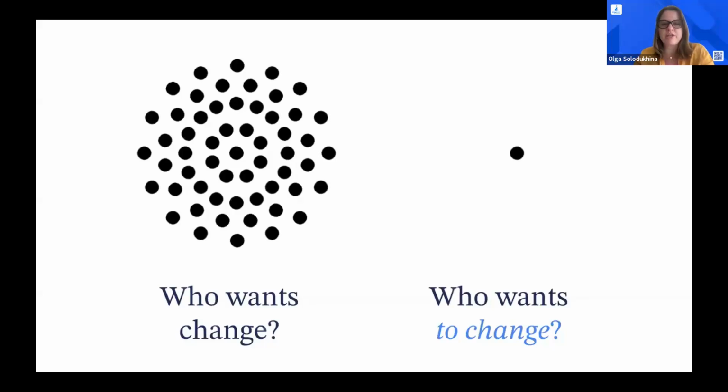So sometimes this change looks really, really scary. We are here for you to help you understand and navigate the process, because we know that this whole change takes sometimes even years.